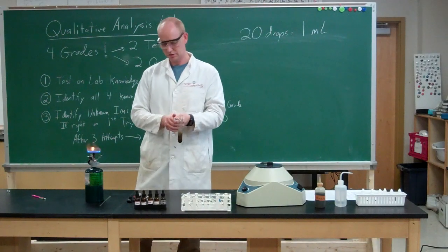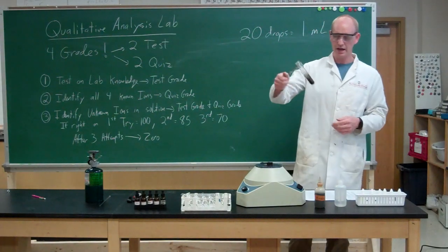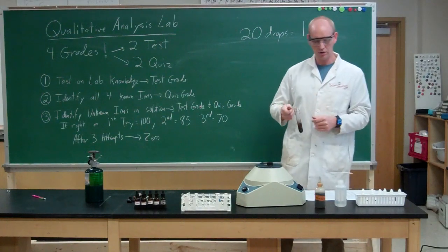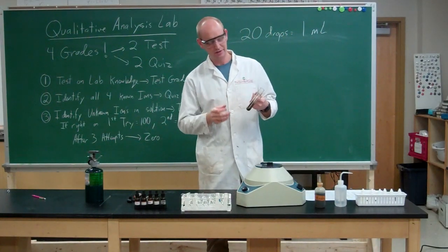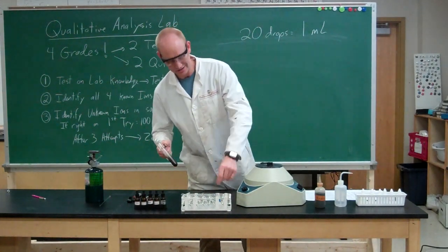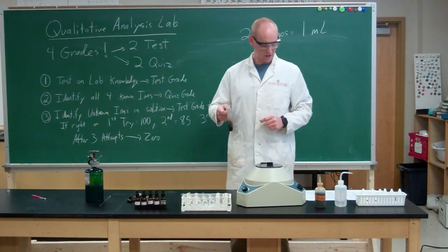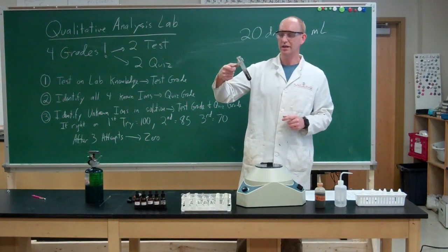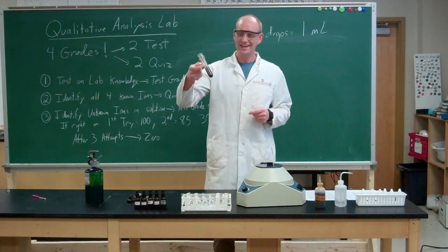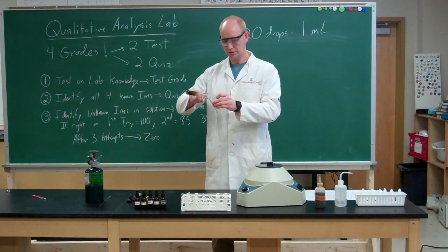All right. I'm going to stop that. Now, if you look in this, I have some chemicals and there's some solid stuff on the side of the walls. Now, I want to separate the liquid part from the solid part. Because in this case, our iron and our nickel, I think, should be solid. No, the iron and the, yeah, that's right. And the aluminum and the chromium should be still liquid. Now, we can't separate in this big test tube. So what we're going to do is pour it into a smaller test tube.